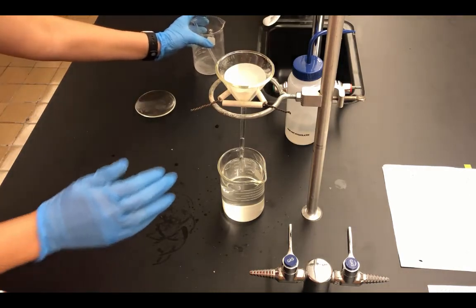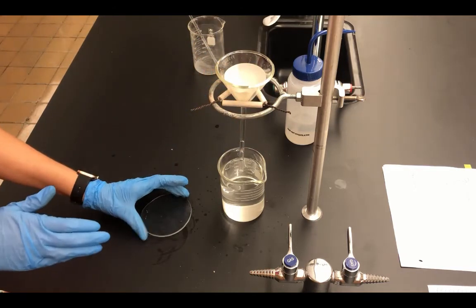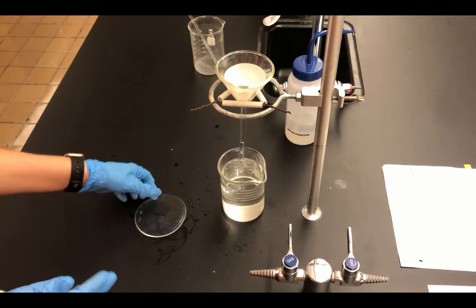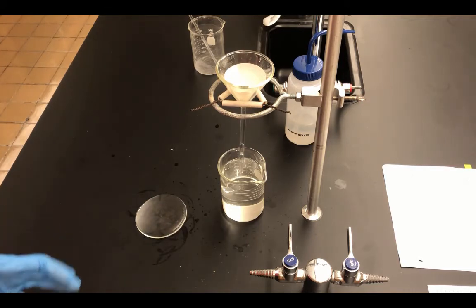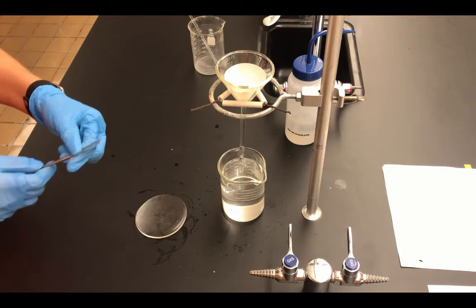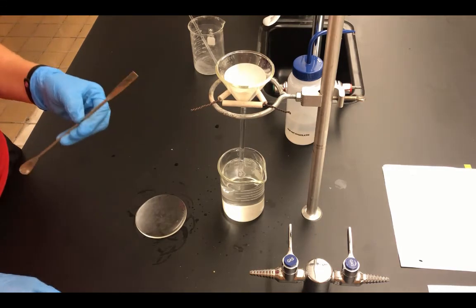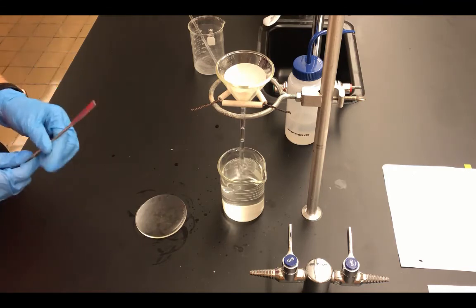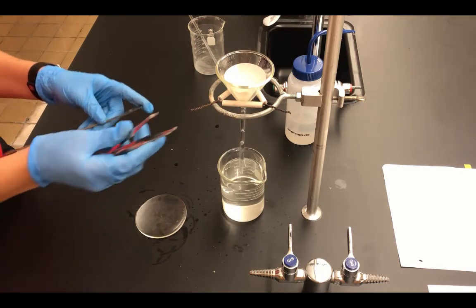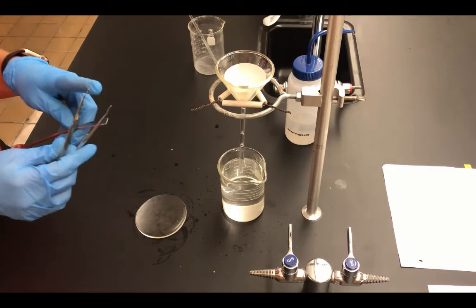And then what we're going to do is remove the filter paper from the funnel, put it onto a watch glass, and then transfer it into the drying oven for about 15 to 20 minutes. So you can use either the end of a spatula, or you can use forceps to remove the filter paper. I recommend a spatula, because if you try to pull on a wet filter paper with forceps, it could rip the filter paper.